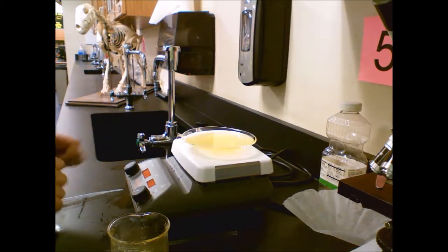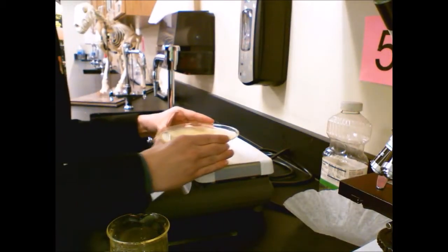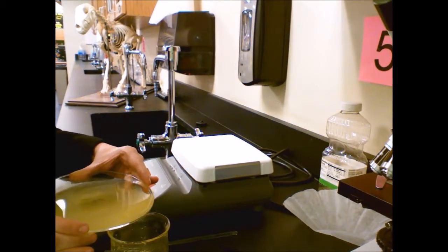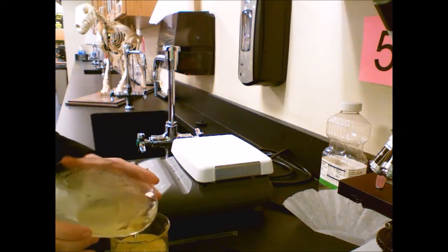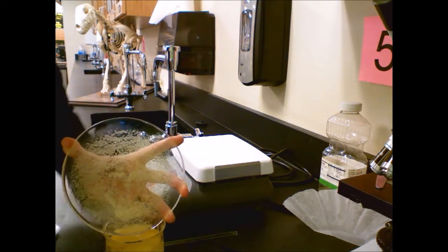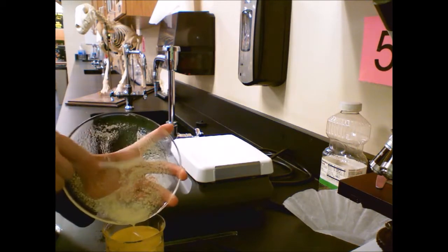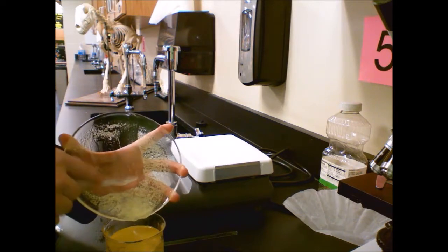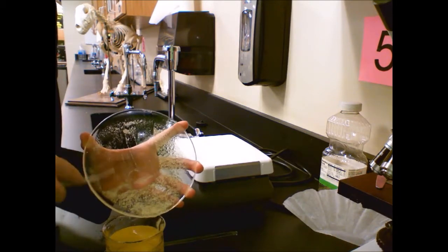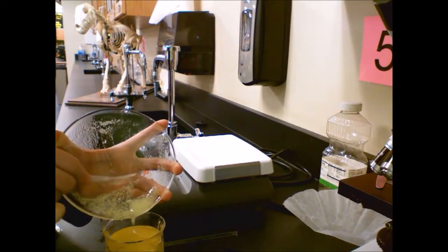Alright, so in this video we are going to be creating orthorhombic sulfur crystals. Ultimately I am redoing this for the benefit of the video because growing orthorhombic crystals takes a long time. Actually, all of these little ditsy dots are orthorhombic sulfur crystals. They are very, very tiny. I spent, what was it, 4 days trying to figure out how to get large orthorhombic sulfur crystals.